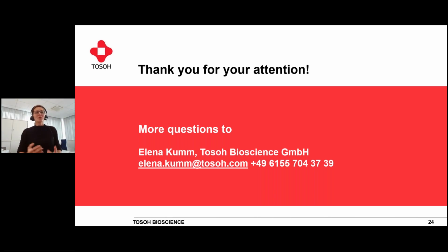It's hard to give a general recommendation if I don't know the sample. That's understandable. So hopefully that's helped adjust the starting point. And as I said, if you adjust parameters, only adjust one per test. Don't adjust three together, because then you don't know which had the biggest influence or what happened. So just start with something and then go from there.